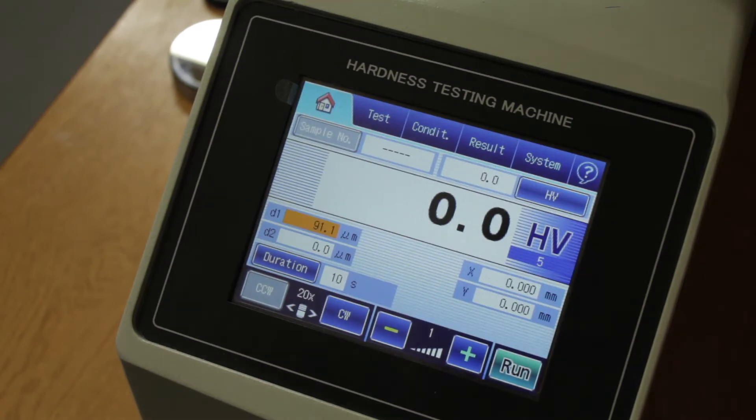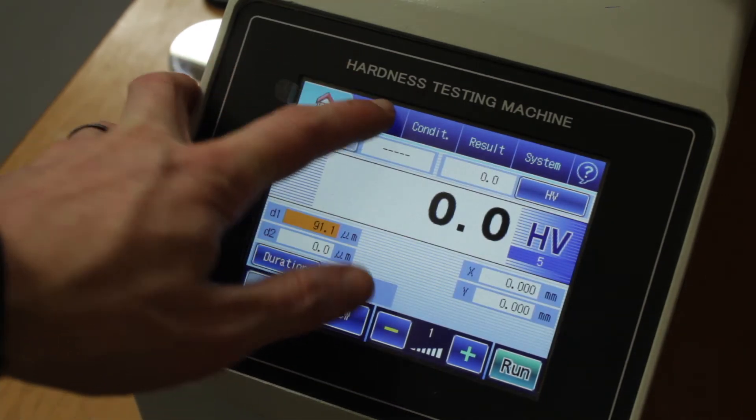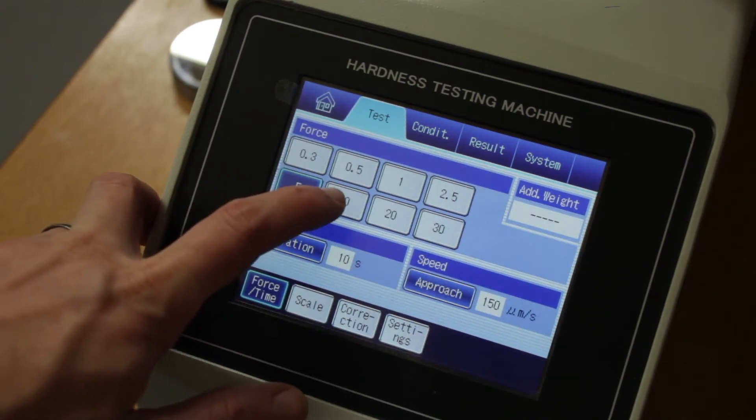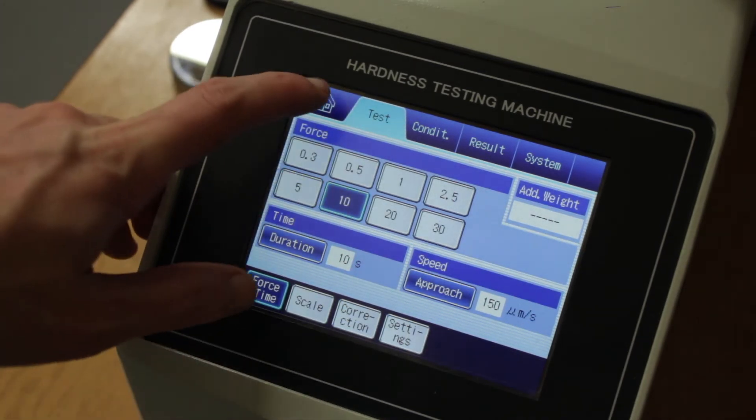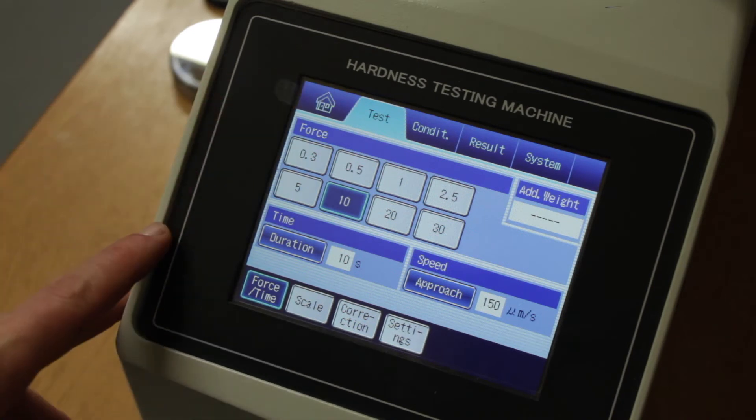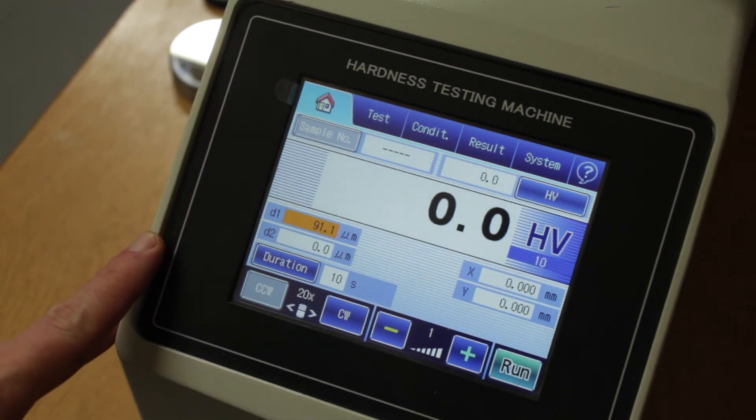This is a touch screen interface and the first thing you'll need to do is set up the test conditions. The force is dependent on the sample. Softer materials need a smaller force, but for most ferrous samples, 10kg force will be sufficient.